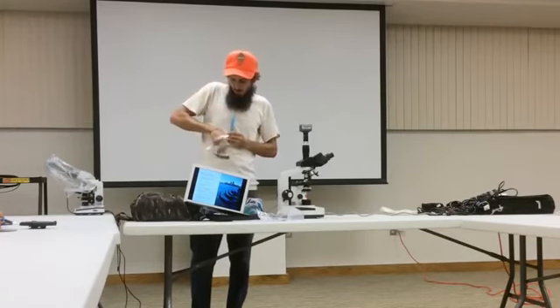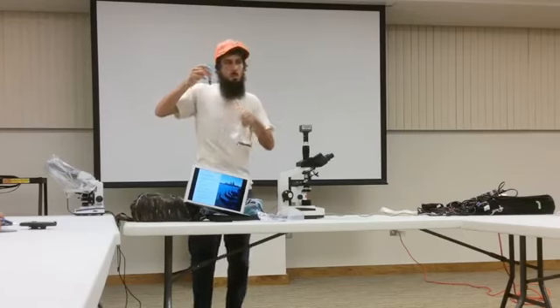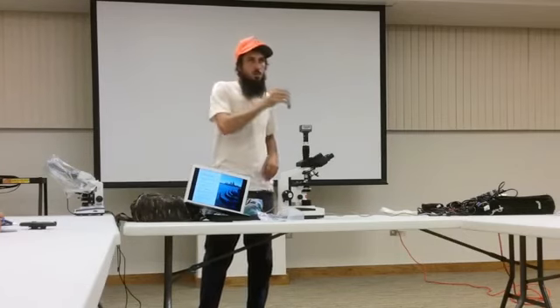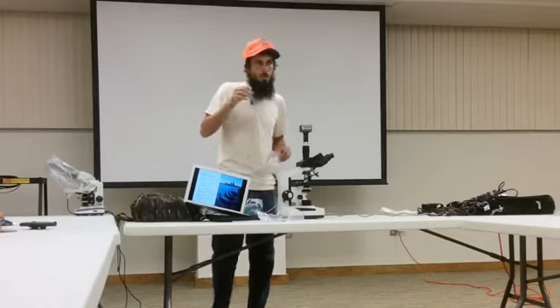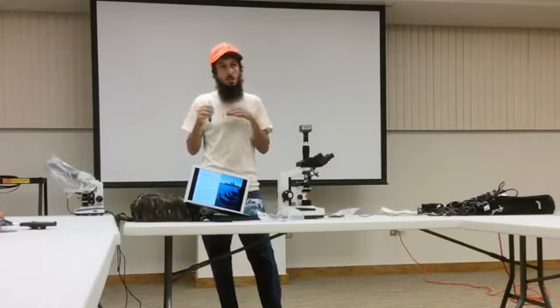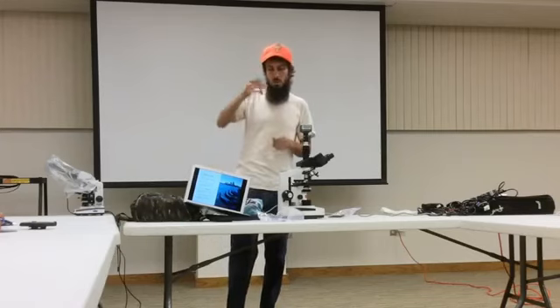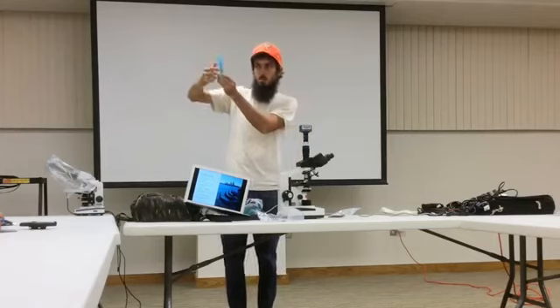1 to 5. And you also change your dilution based on how your sample ends up looking. If I'm looking through and I can't see anything, it's too muddy, then I can dilute more. If I'm trying to count certain things... But 1 to 5 I find is good. So you see now it's up to 5.